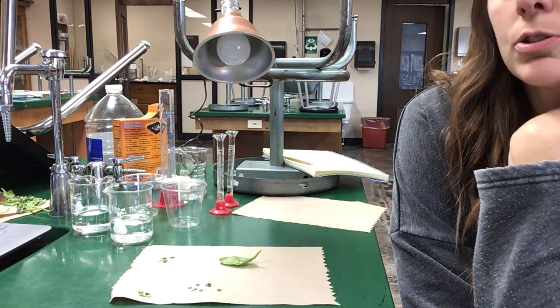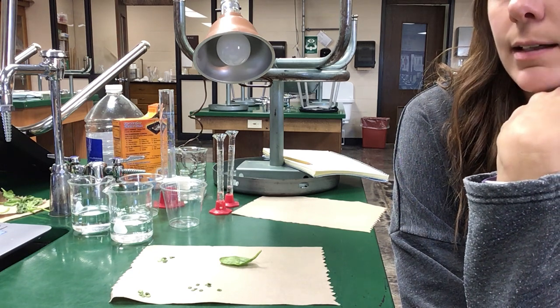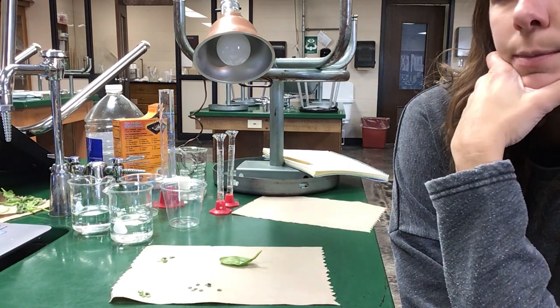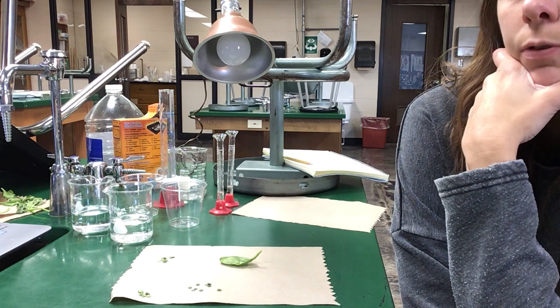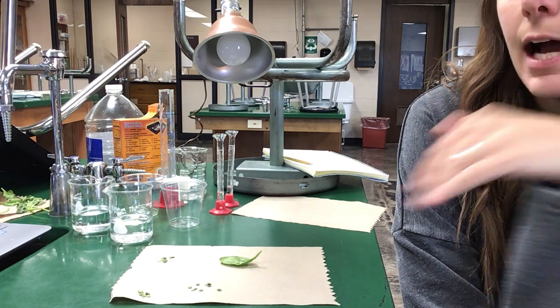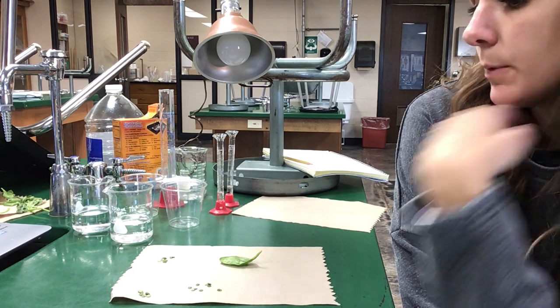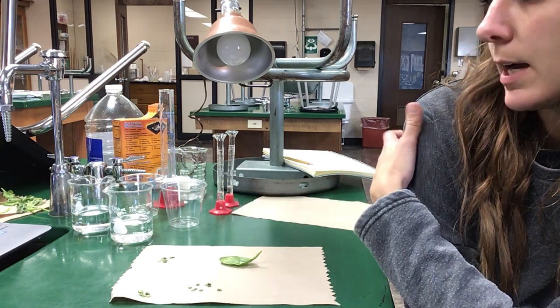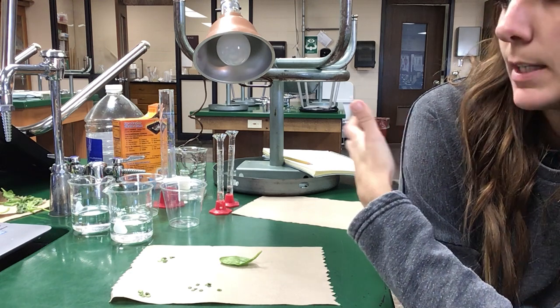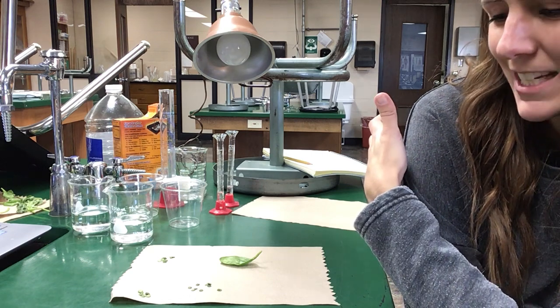This bicarbonate solution goes in those spaces, increases the density of the leaf, and therefore makes it sink. So we're going to sink all these leaf discs, put them in solution, and then measure photosynthesis indirectly by looking at how long it takes oxygen to refill those spaces. I set up everything in the lab, which is on Schoology for you. The next thing I have to do is sink these leaf discs.